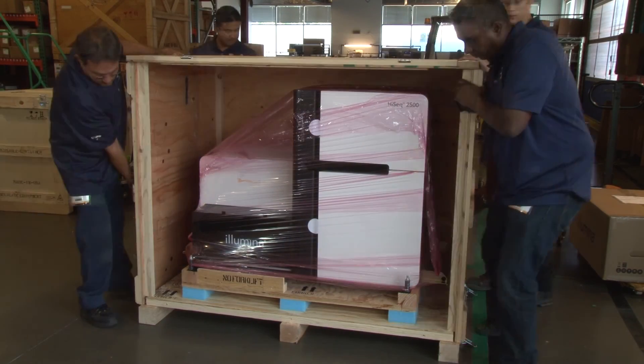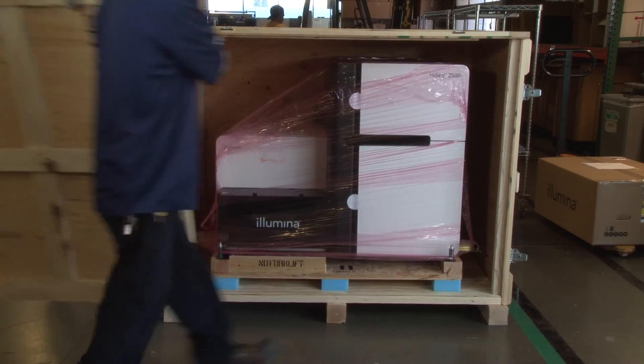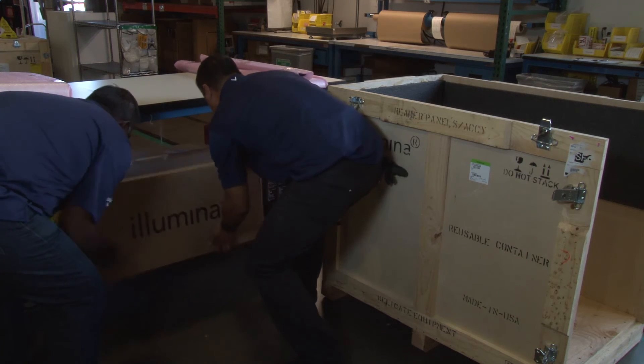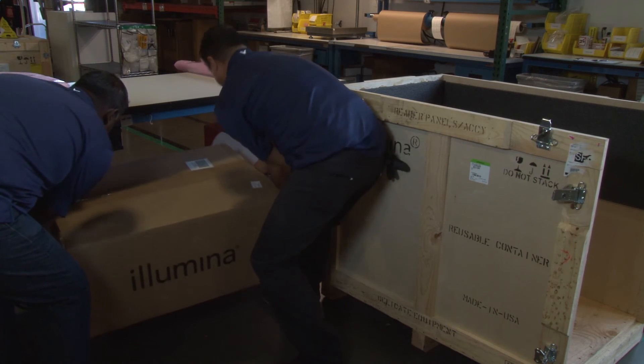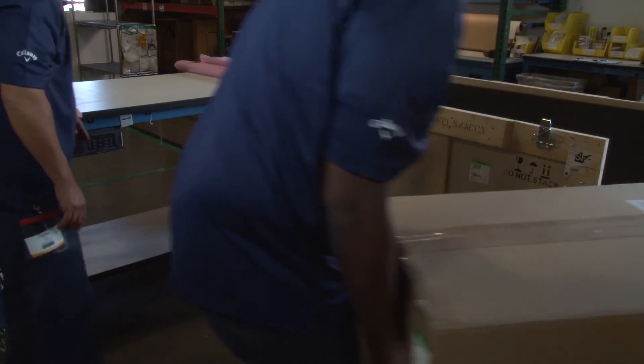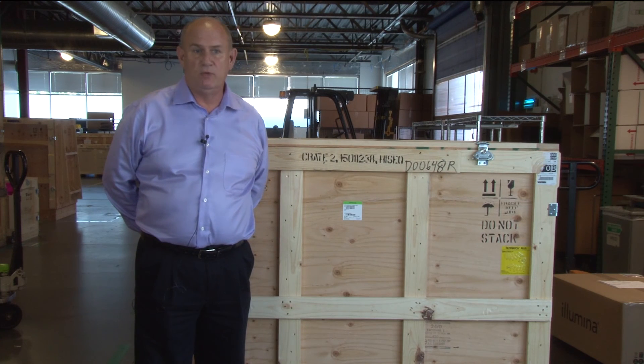Add the connected four-sided piece of the crate and latch them to the base. Add the front panel of the crate and close the latches. Place accessories into the second crate. Ensure copies of returned paperwork are placed in the crate if applicable. Now the HiSeq is safely crated and ready to be moved.